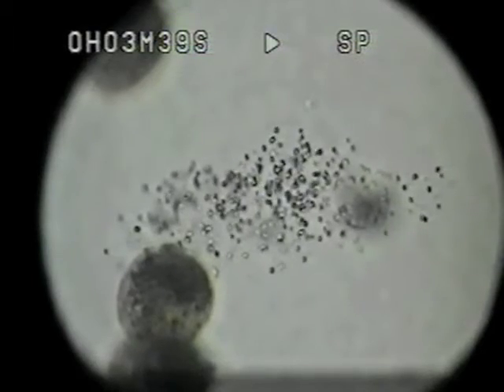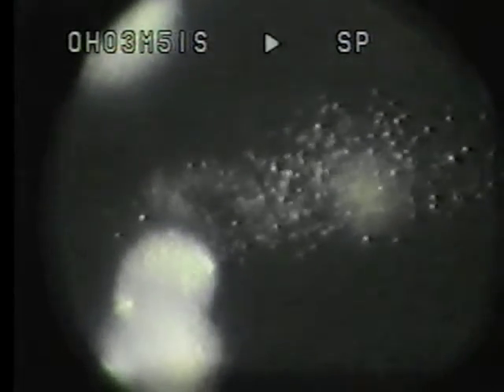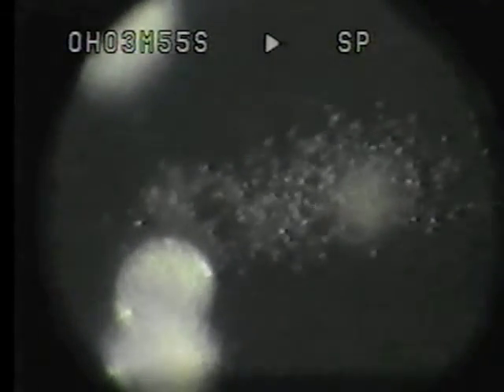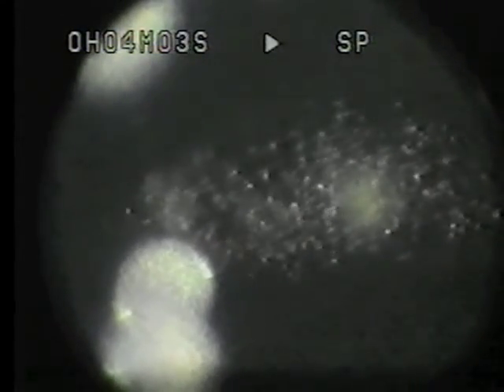Well, let's light that from above just for fun, and we'll see the granules that are all twinkling. You see the little twinkle — twinkle little granule. I wonder what they mean. That's really nice, looks like something in the heavens.